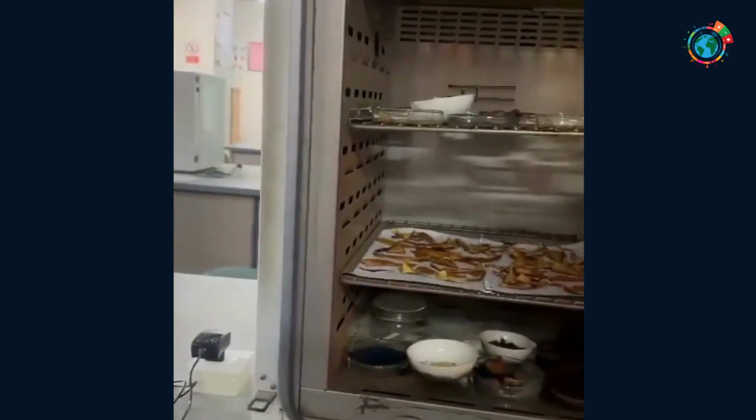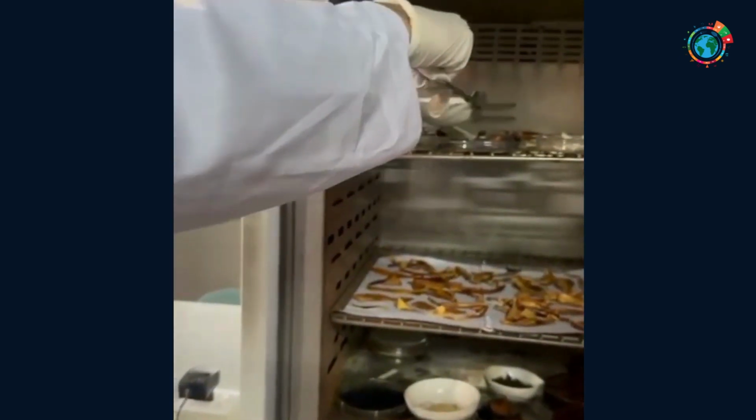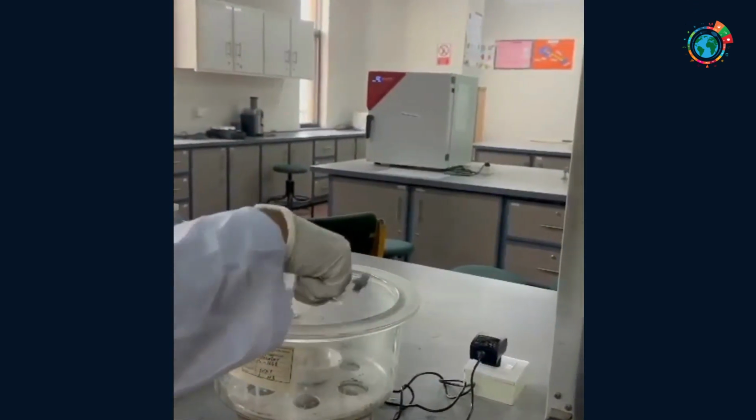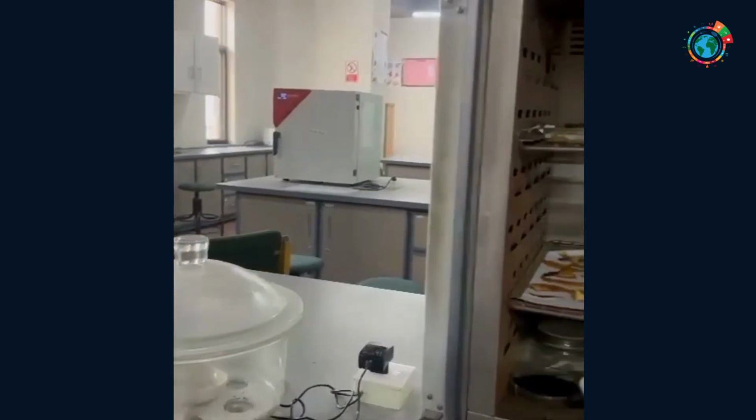After 4 to 5 hours of drying at temperatures ranging from 100 to 110 degrees Celsius, now is the time to take the china dish out of the hot air oven. With the help of metal tongs, carefully grip the china dish and transfer it quickly to the desiccator. Close the door of the hot air oven after taking out the china dish.